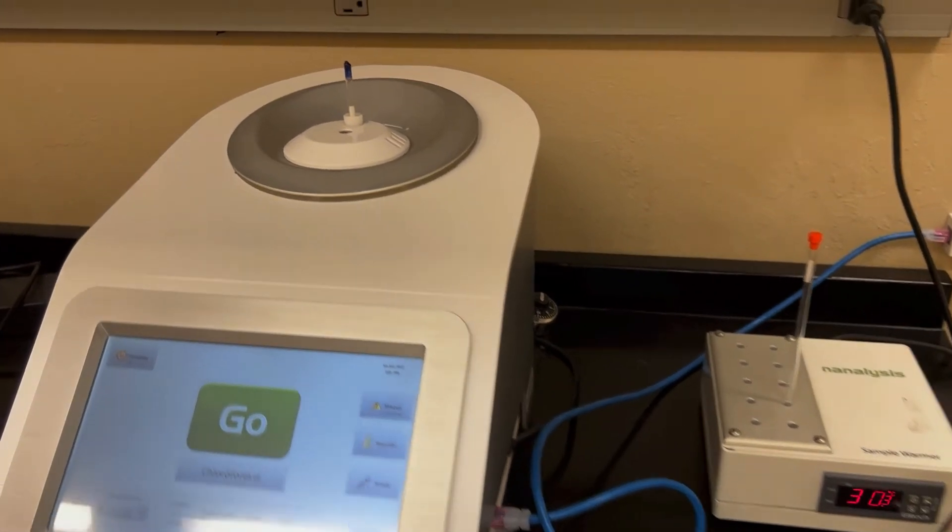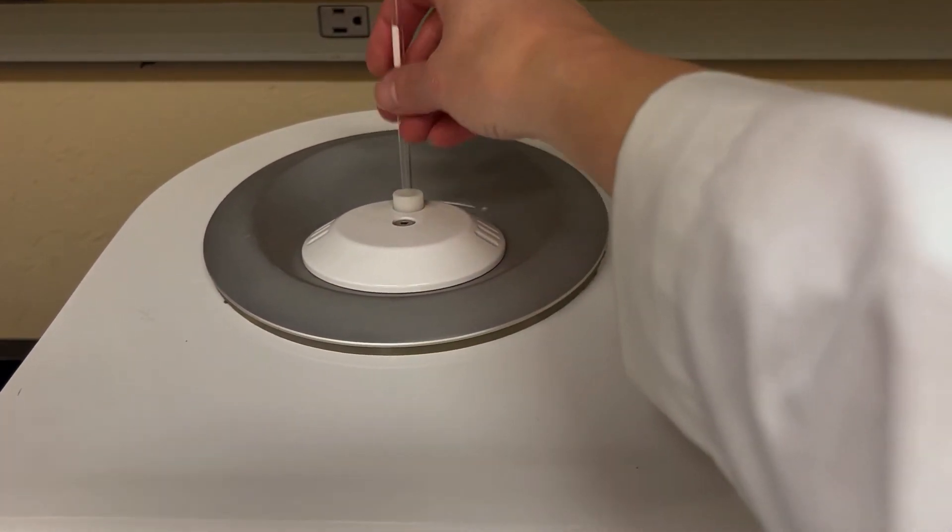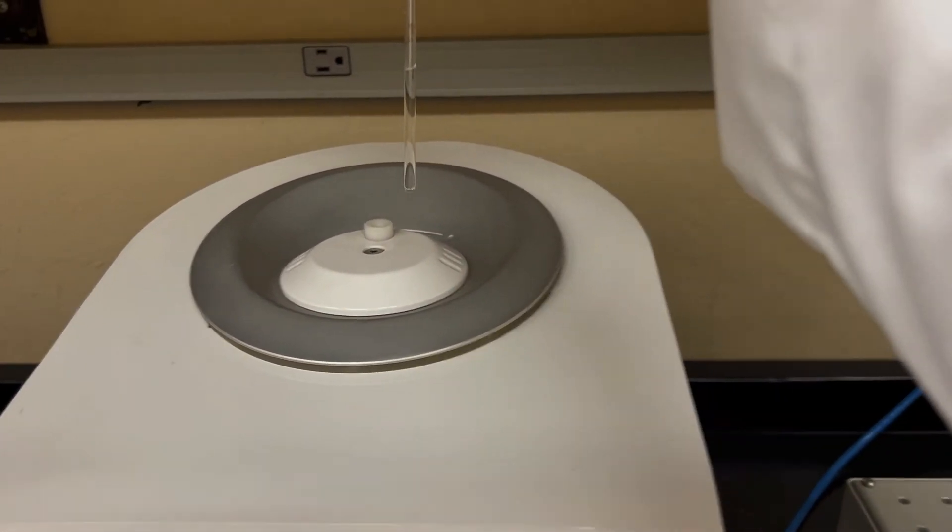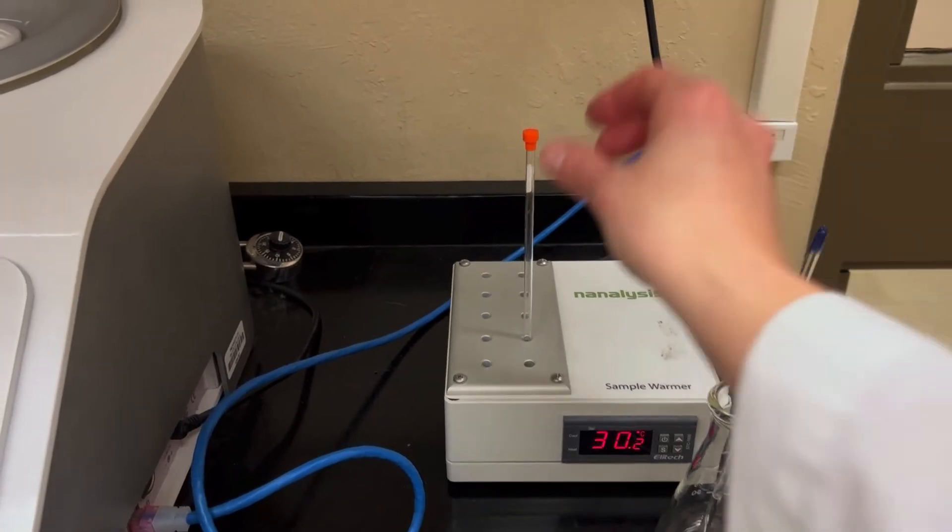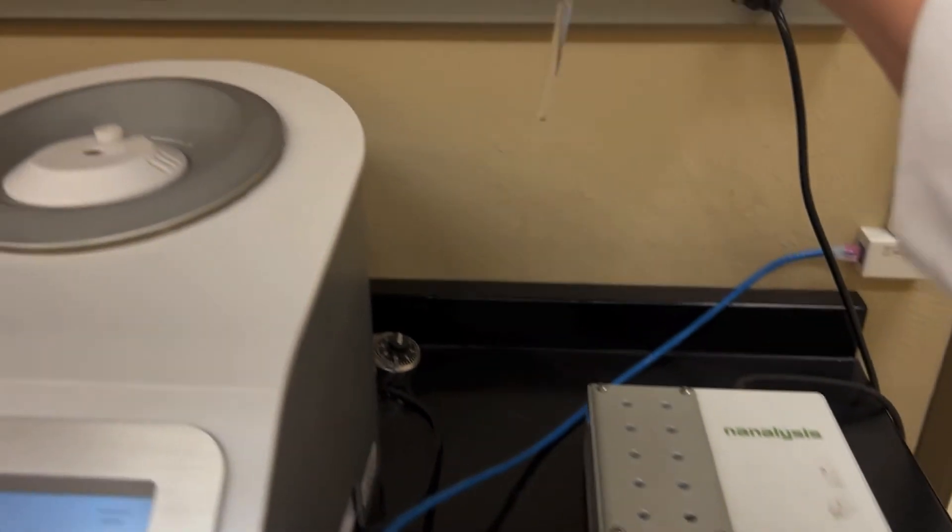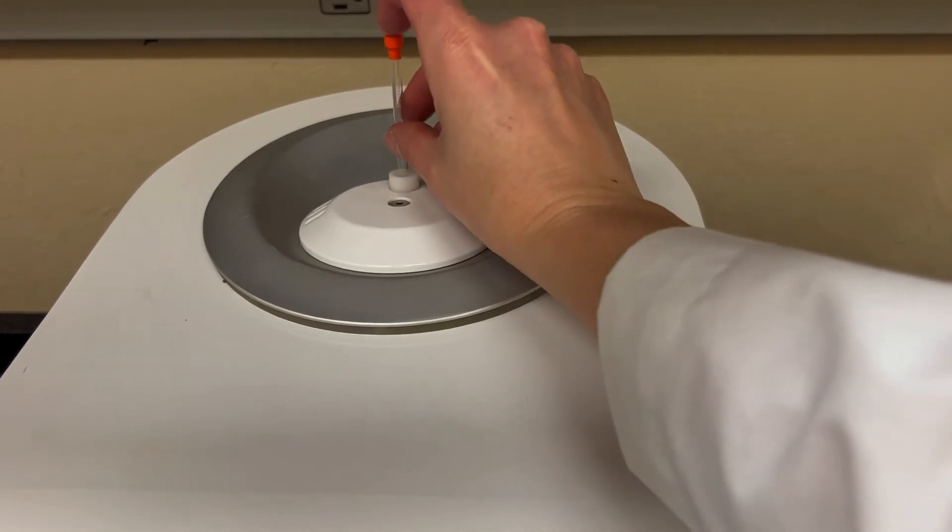After two minutes you're going to remove the reference sample which is always kept in the instrument. Remove it while keeping it vertical so that you don't snap it in half and then you can just set that aside. You can then take your warm sample and place that inside the instrument again keeping it vertical and just push it in until it won't want to go any further.